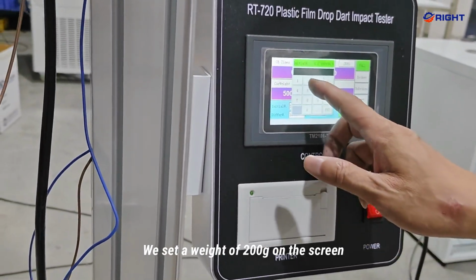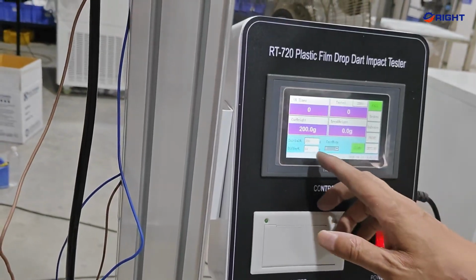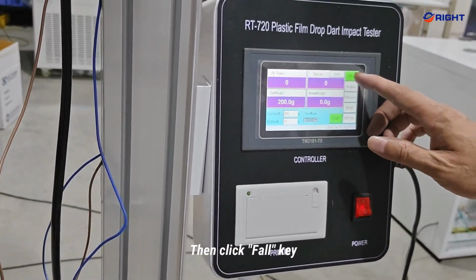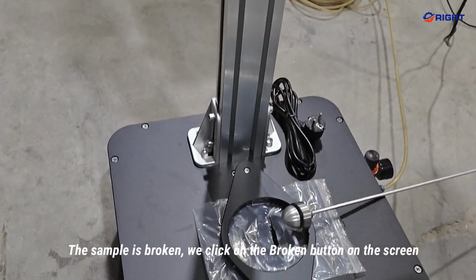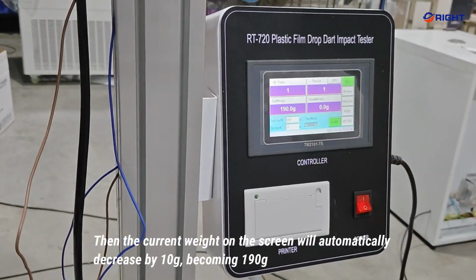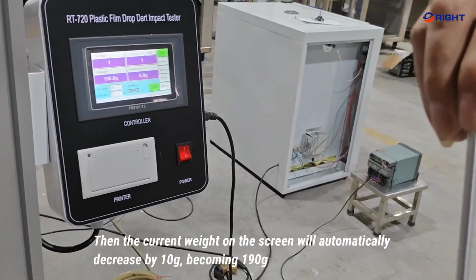We set a weight of 200 g on the screen. The default impact deviation is 10 g. Test method, choose A. Then click the Fall key. The sample is broken. We click on the broken button on the screen. Then the current weight on the screen will automatically decrease by 10 g, becoming 190 g.